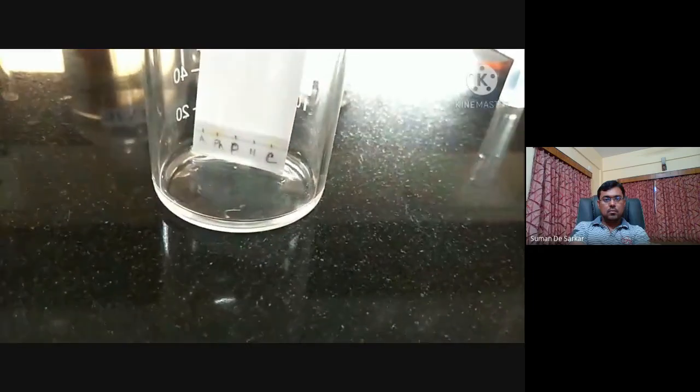So now we'll put in the TLC. All the spotting is complete now, so we are inserting it into the TLC chamber. Insert it carefully, and you see only a little part of it will be inside the solution here. Up to here there is a pencil mark, and the solvent front is lower than the pencil mark.